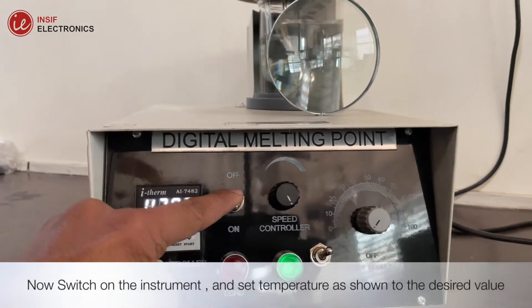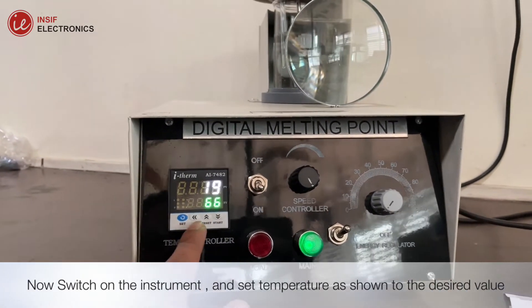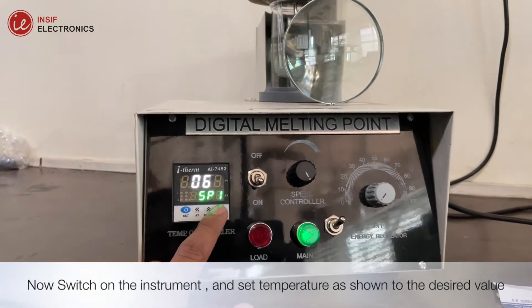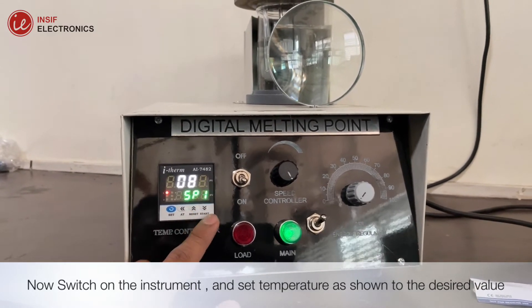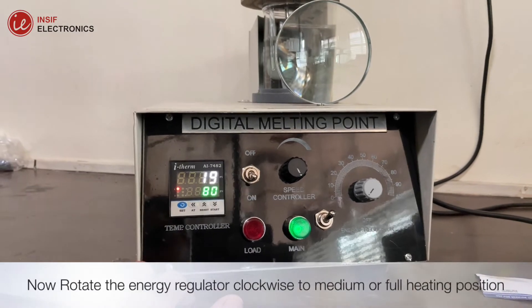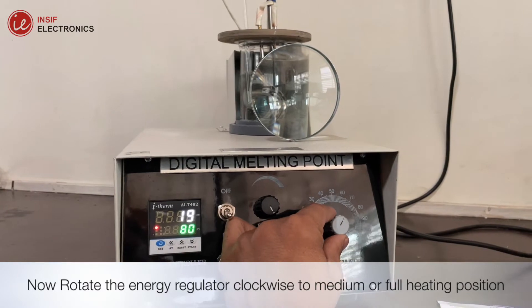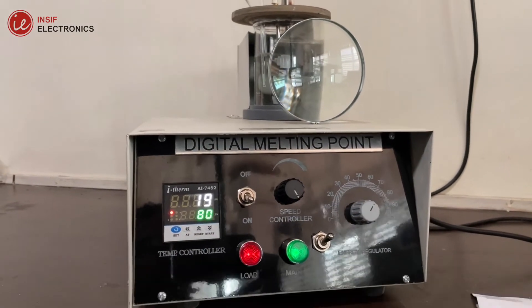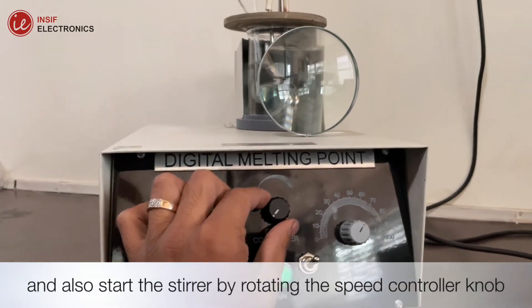Now switch on the instrument and set the temperature to the desired value. Rotate the energy regulator clockwise to medium or full heating position, and start the stirrer by rotating the speed controller knob.